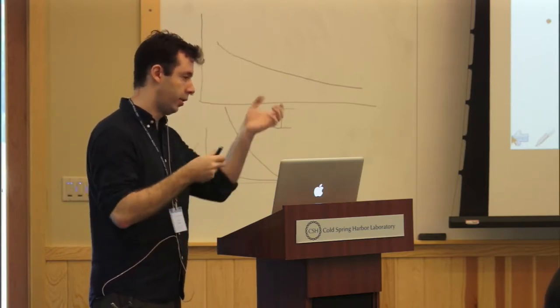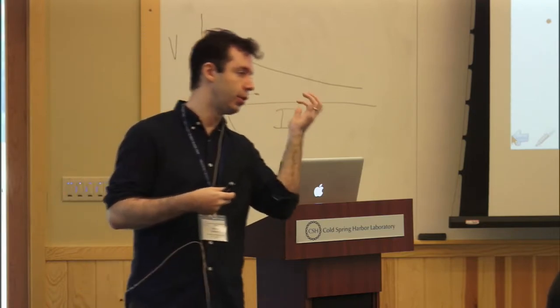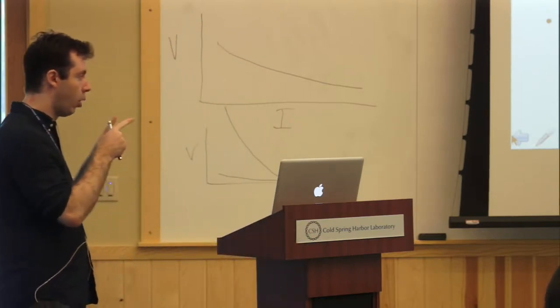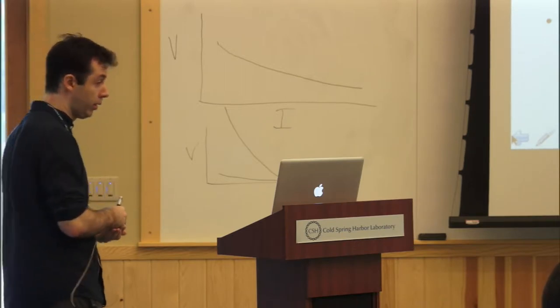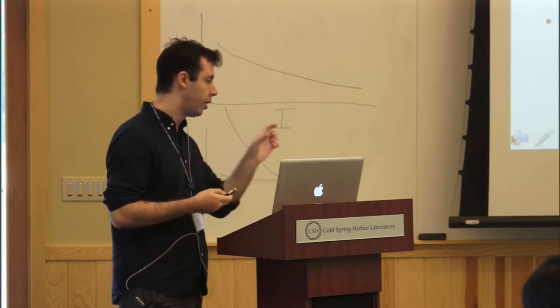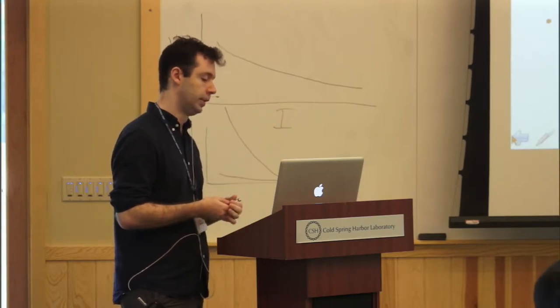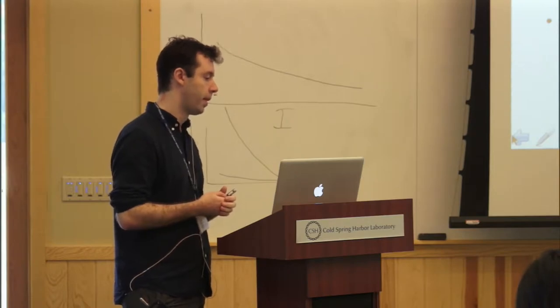Just because, if you push that idea, if you sequence 6 nucleotide long reads, you're going to map to many locations. Now the reads have become longer. Almost by default, people use these 50 base pair long reads for sequencing for most applications. And that allows you to map most of the reads with very high uniqueness. So 50 is definitely good for most applications.